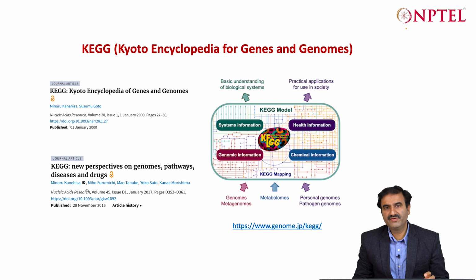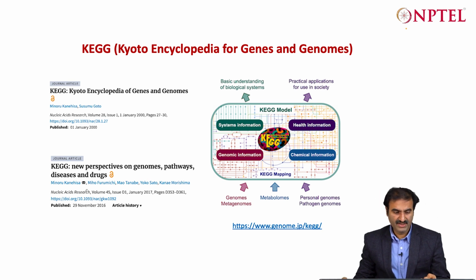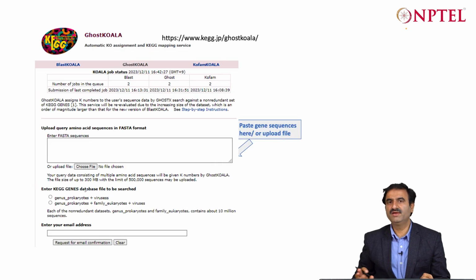Okay, so KEGG is a database of pathways, metabolic pathways, genes, proteins, diseases, reference pathways. It also has a very good feature called KEGG Orthology, where it has assigned KO numbers to all the genes, so that it can compare a new gene against a known gene and directly assign the same KEGG Orthology to that gene. And then there are reference pathways for various metabolic pathways that exist. So this makes it a very unique and comprehensive database for pathways.